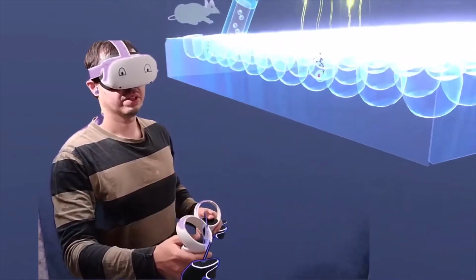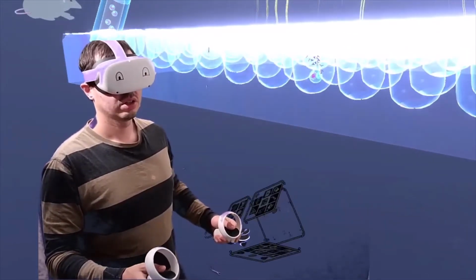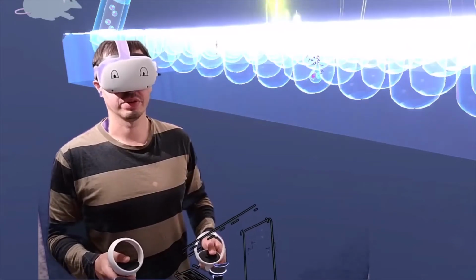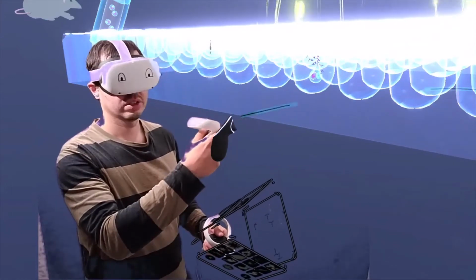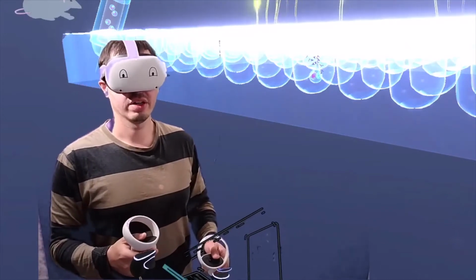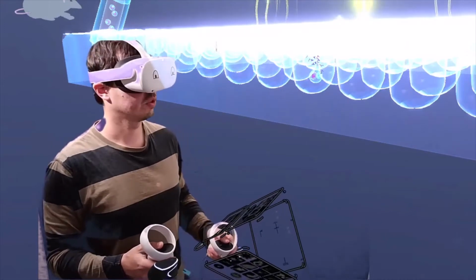If you dilute them enough, most wells have nothing at all inside them, nothing but diluent. In some wells, you'll get one cell, and in others, very rarely, you can have more than one cell. These ones aren't interesting to us today.